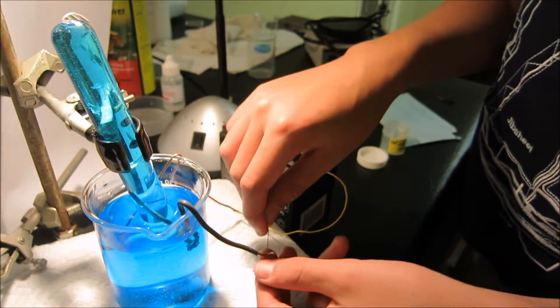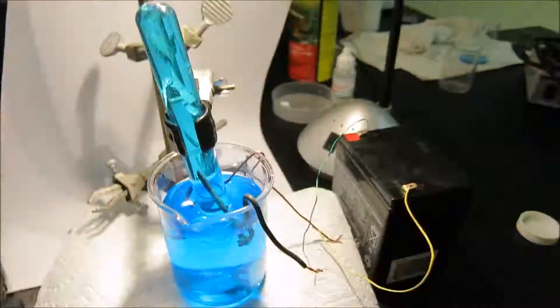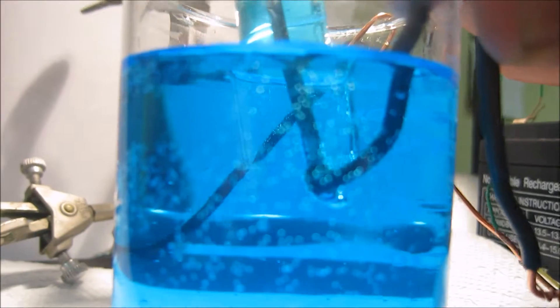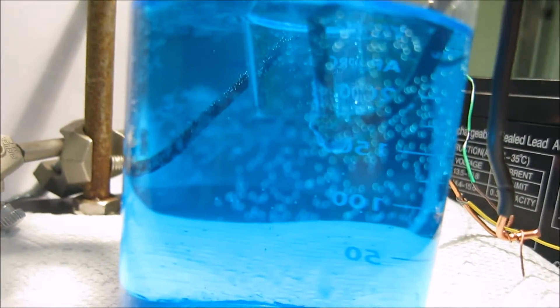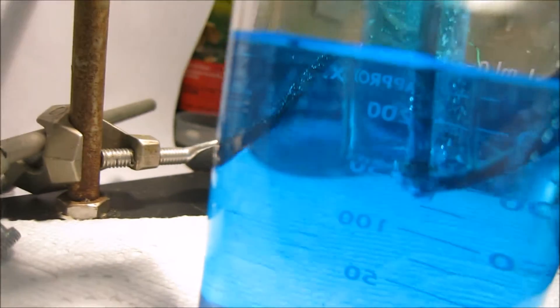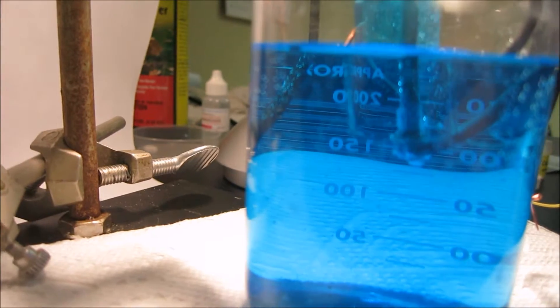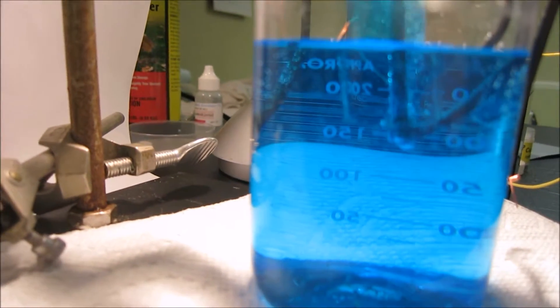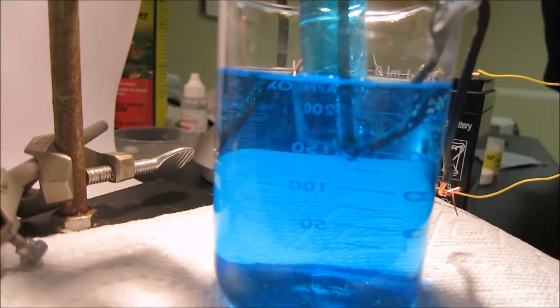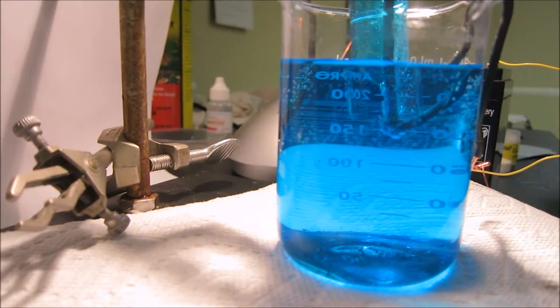So let's connect them. This gas is supposed to be oxygen, and as you can see the copper wire is slowly having copper precipitated onto it — that is supposed to be copper.